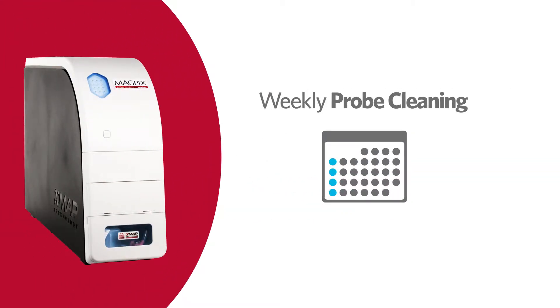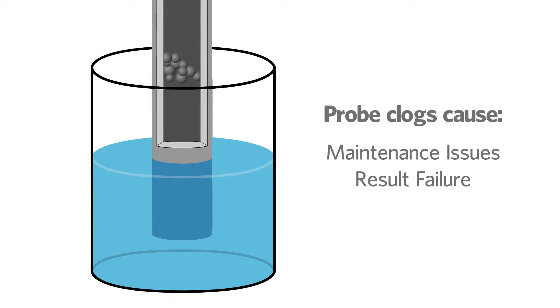Cleaning the sample probe on the Luminex MAGPIX instrument is a weekly maintenance procedure. Cleaning the sample probe ensures there are no clogs in the probe. A clogged probe could prevent the appropriate amount of sample and reagent uptake, causing maintenance issues or result failure.